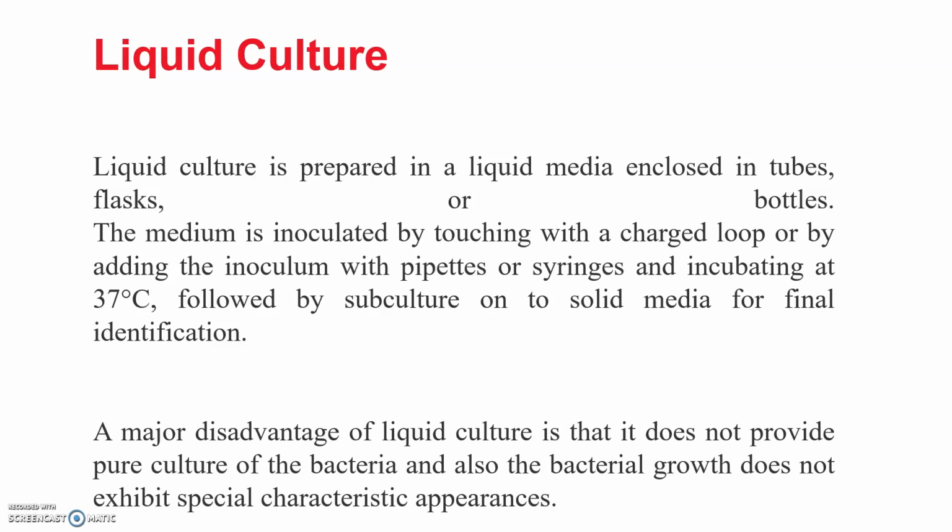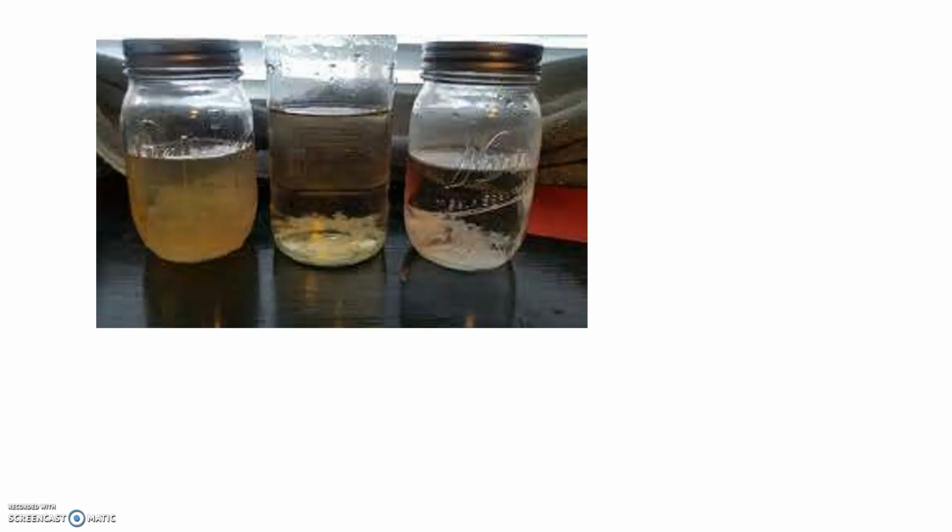The major disadvantage of this liquid culture is that it does not provide pure culture of bacteria, and also the bacterial growth does not exhibit special characteristic appearance. So we can't isolate a single or pure culture of bacteria using this method, and we can't see any special characteristic appearance of the bacteria. So this is an example for liquid culture, how we are making the liquid culture.